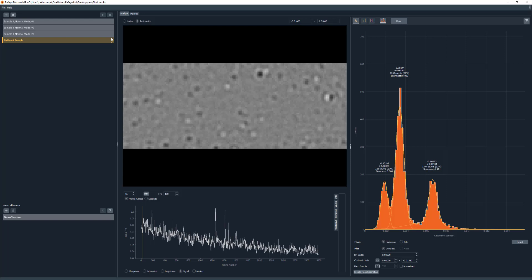Fitting a peak to the data provides information about peak position, peak width, integrated counts, and skewness. Information about the fit is displayed above the curve.